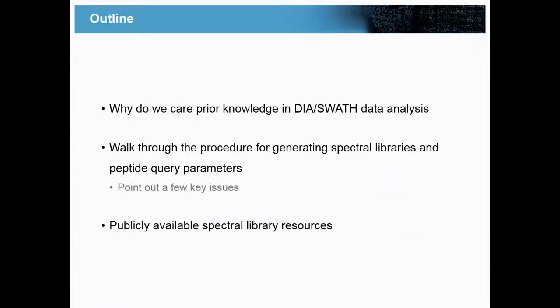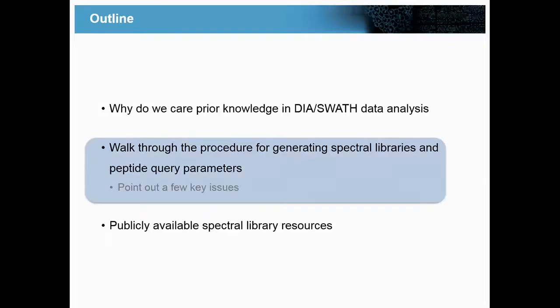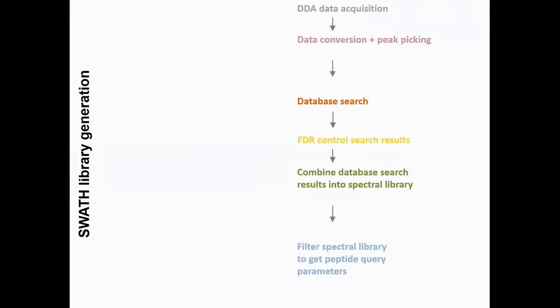So that's why we care. So now let's look at the procedure. Those of you who are familiar with DDA data analysis will recognize much of this workflow. We're doing typical DDA data acquisition on some samples of interest.